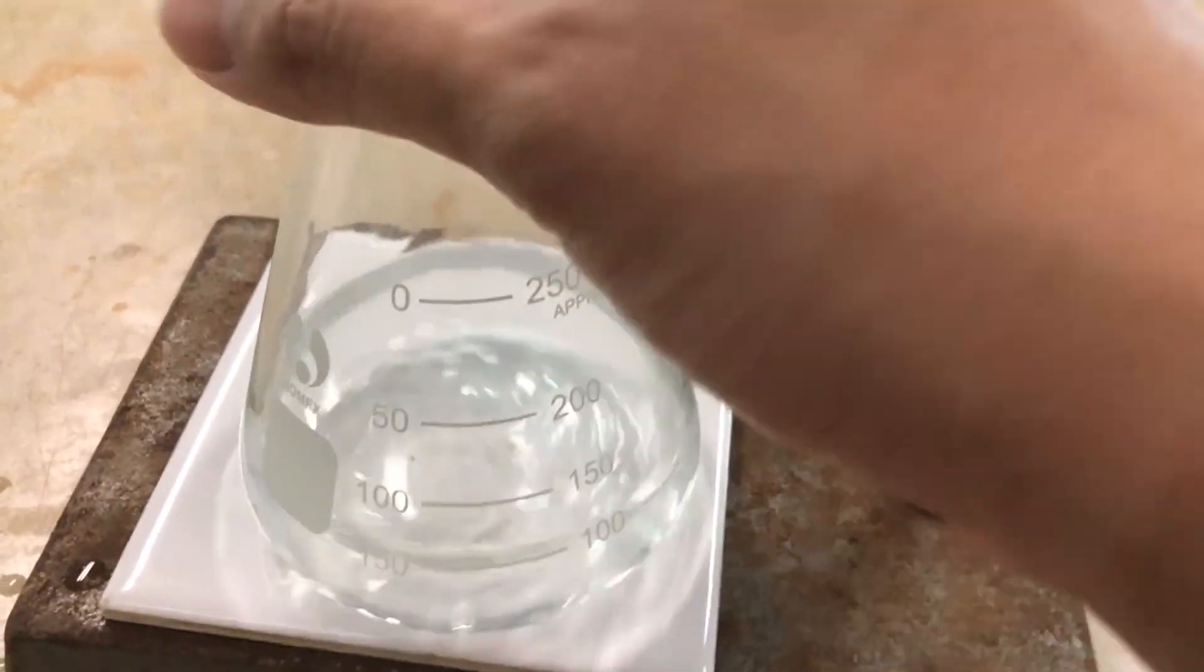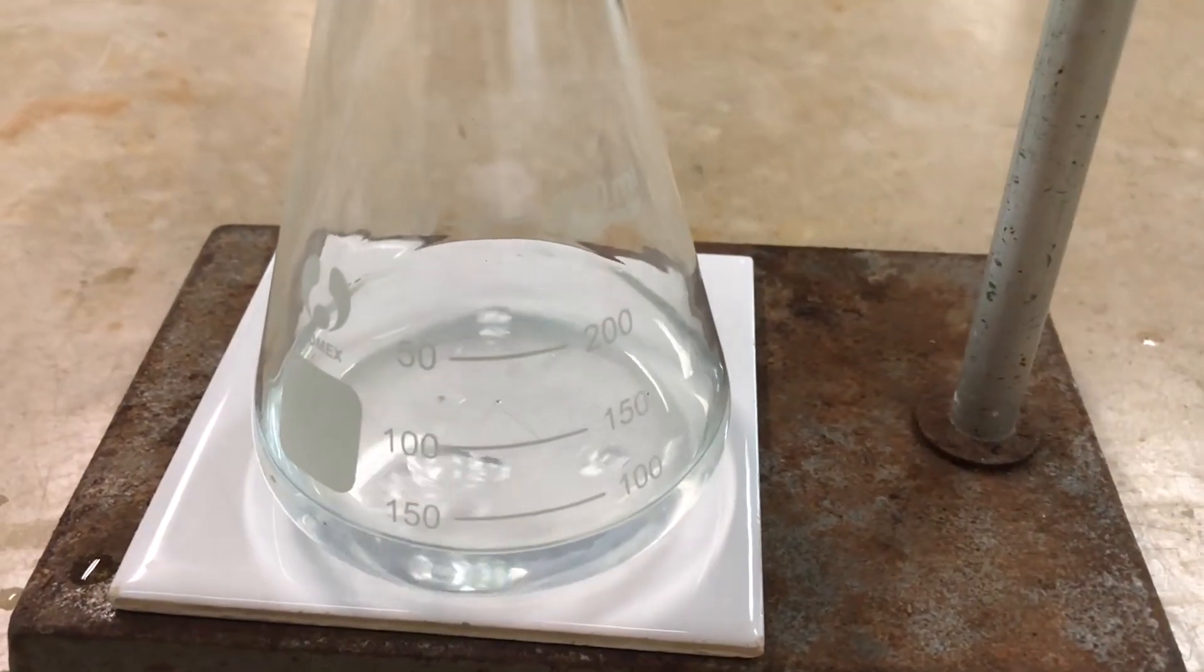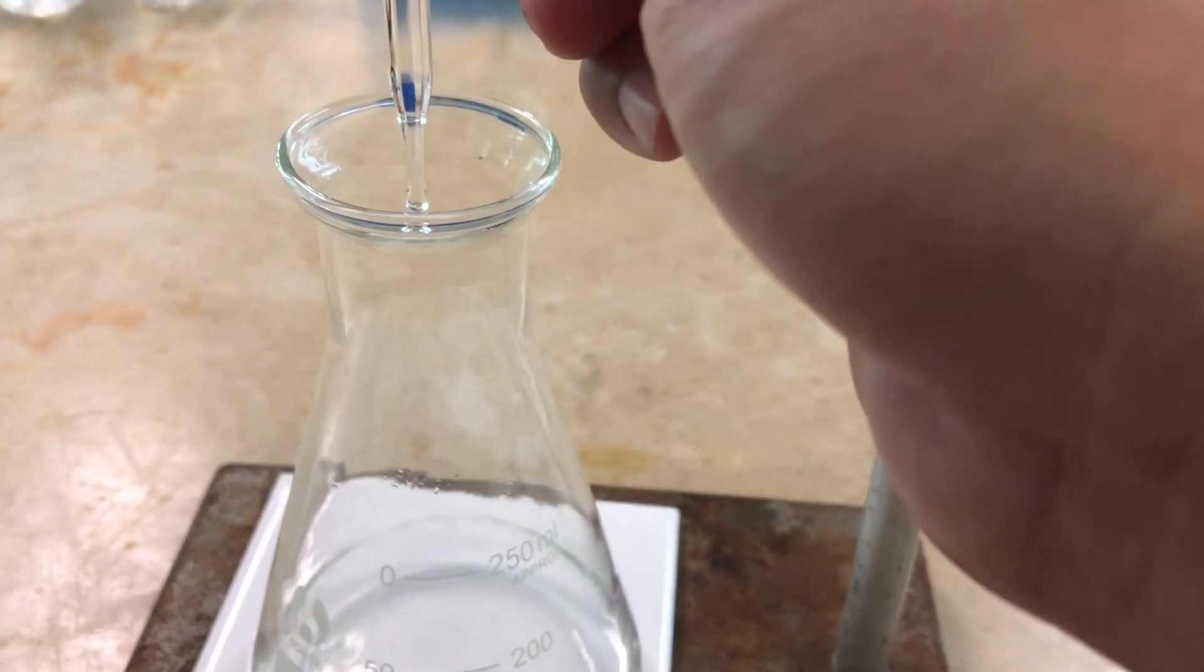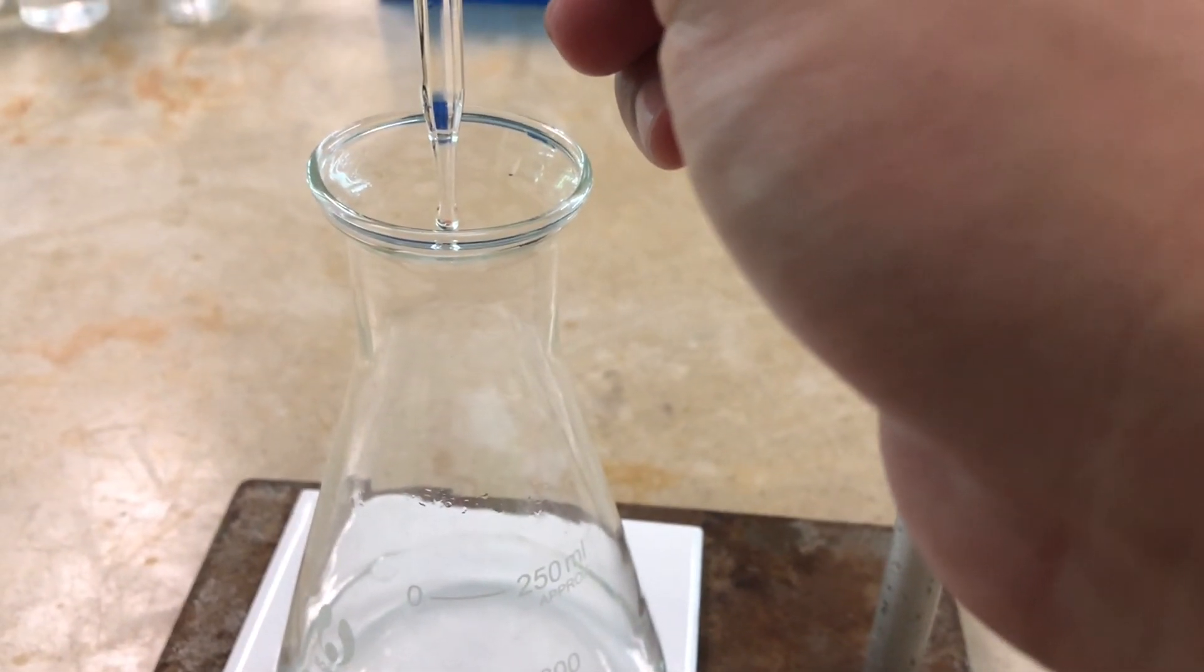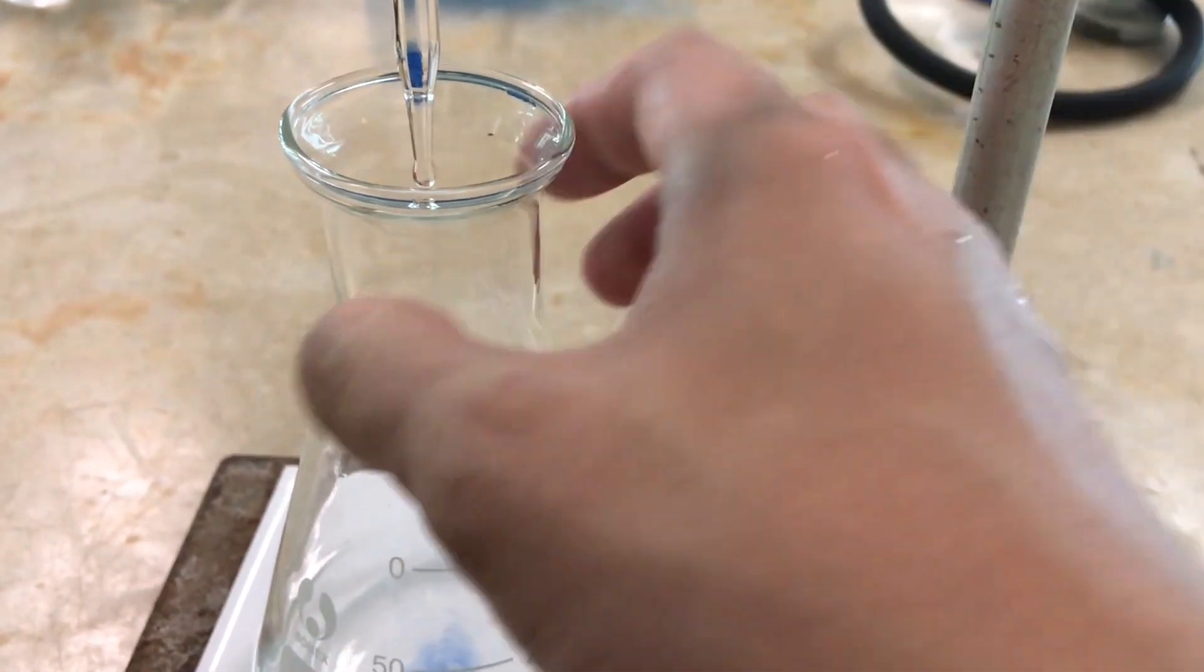Take special note to add in only a drop at each time, turning off the tap, swirling it to allow the color change to happen. Have a bit of patience, make sure that you only add in one drop at each time, and you'll realize that the color change will happen immediately once you've added in the correct volume of titrant.